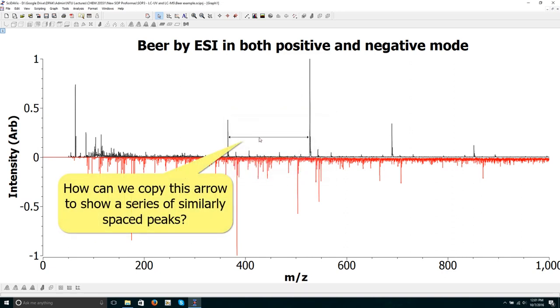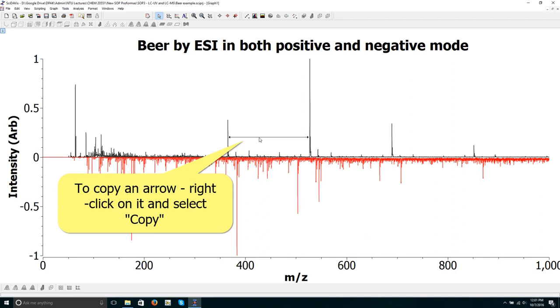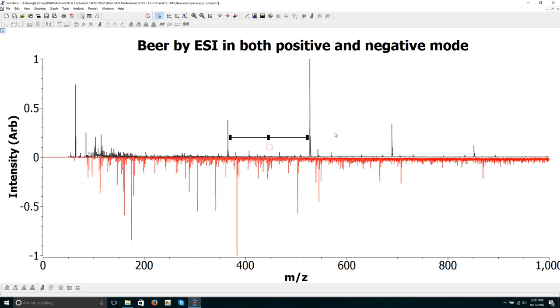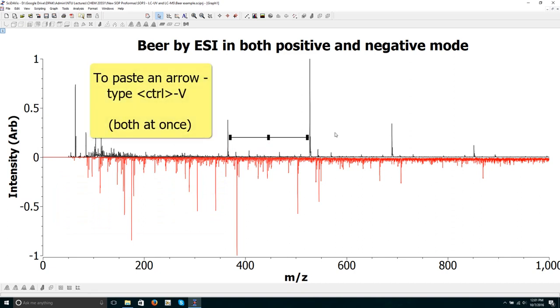How can we copy this arrow to show a series of similarly spaced peaks? To copy an arrow, right click on it and select copy. To paste an arrow, type Ctrl+V.